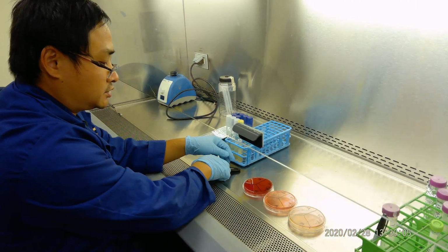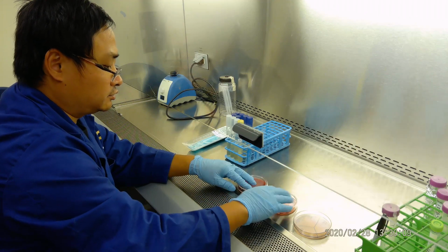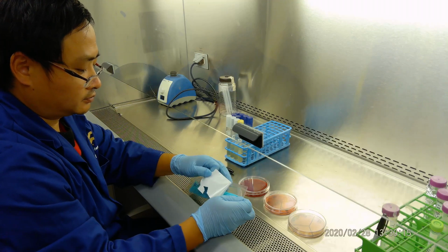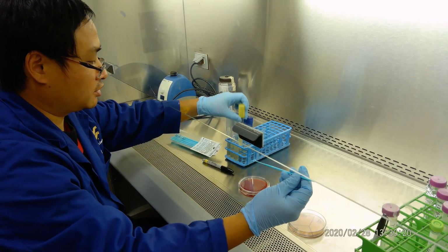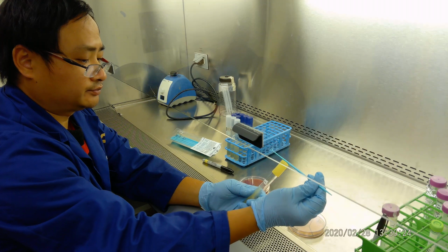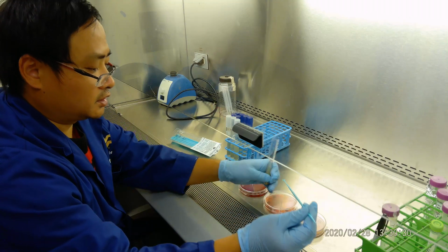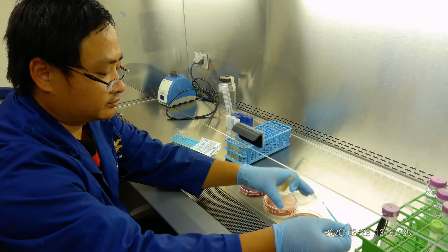After we're done with this, we will do the inoculation. Now the inoculation, you can do them together. So we have a loop. We're going to take the loop out. Get one loop. Okay, so we have E. coli, and we have Staphylococcus aureus first. Take a picture, Lee. So we take it out, and we get it from here. So very simple. We do a very easy streak like that.